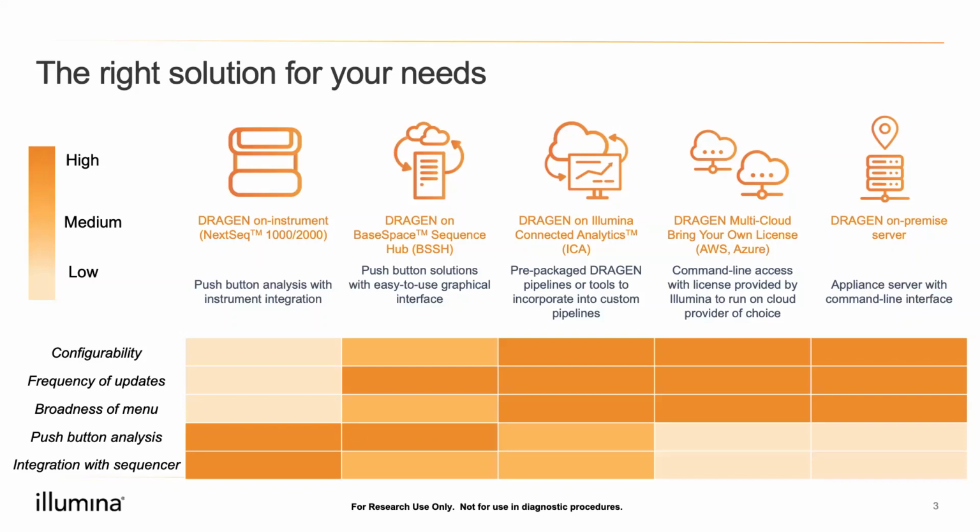It doesn't receive every DRAGEN update, though. We aim to update it about once a year. And it has a fixed menu of applications.